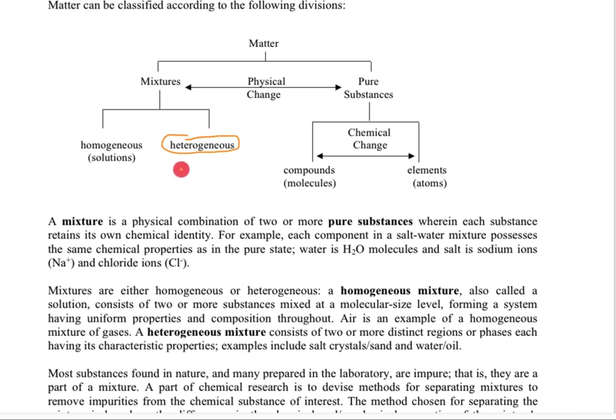The 3 different compounds that are actually in the sample: sand, which has a chemical formula, silicon dioxide. There's something called ammonium chloride, and then sodium chloride. 3 different components. Sodium chloride is the main component in table salt. Now, the 3 together create a mixture. Once we actually separate the 3 samples, we're going to have 3 individual compounds.